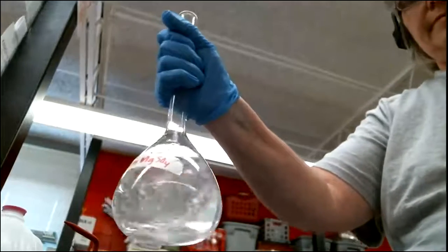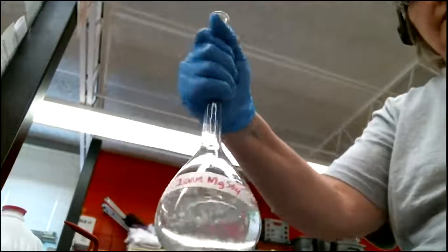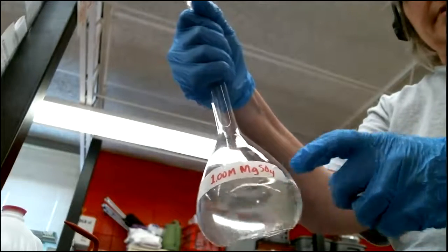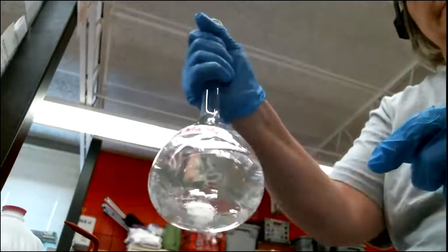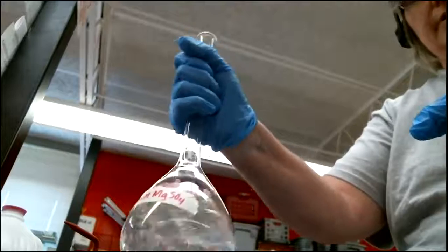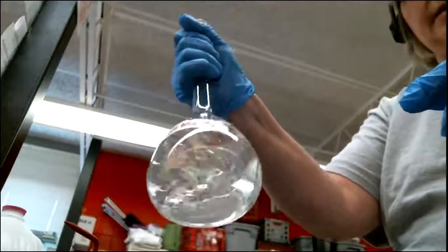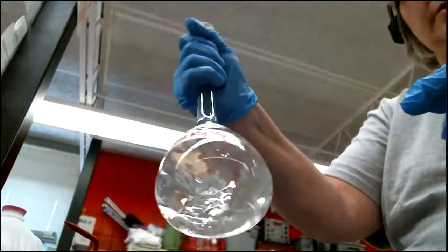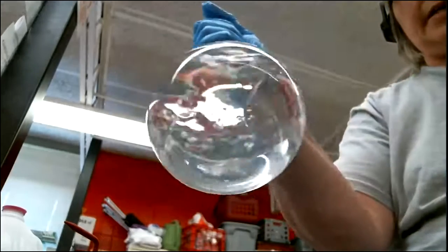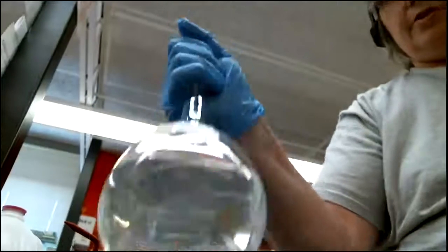And now I'm going to swirl it. You can see I labeled it. Of course, you can't read it, it's backwards, but it's 1 molar magnesium sulfate. So in the lab, we label everything so people don't think that's just water. It looks like water, but that's not what it is. You saw us, we put salt in there. It would be worse for something like hydrochloric acid or sodium hydroxide, something strong. As I stir it, I can feel the bottom of it's kind of cool to the touch. You can still see some salt swirling around on the bottom, but it's not as much.